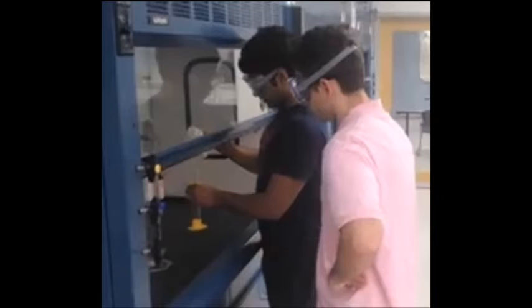Now it's time to talk about lab etiquette. So when performing an experiment, there are two factors we want to consider: accuracy and precision. Now, for some labs, depending on where you are, precision is quite important, whereas for other labs, precision is not as important as accuracy. And the distinction between the two is that precision is how close each measurement is to the other, whereas accuracy is how close each measurement is to the actual value of whatever you're measuring.